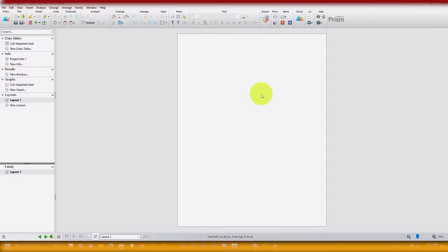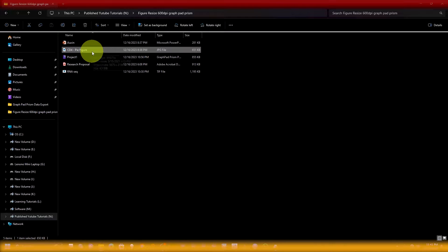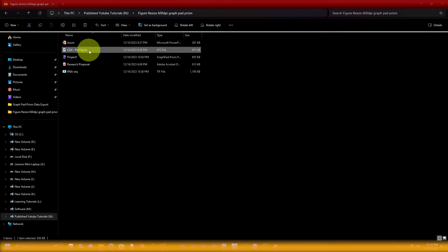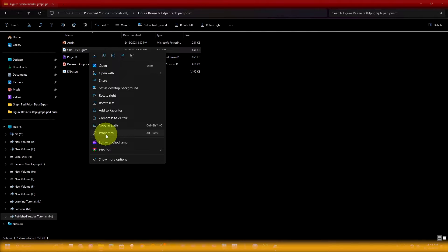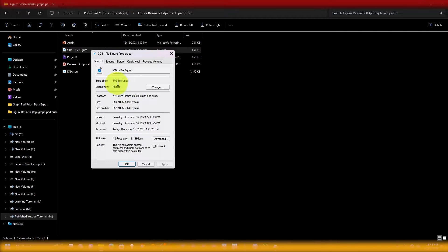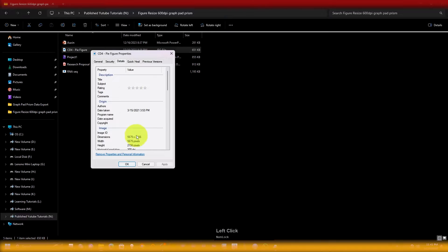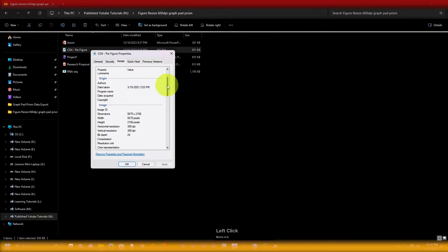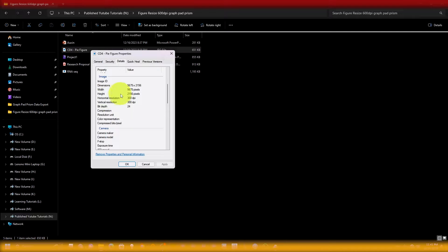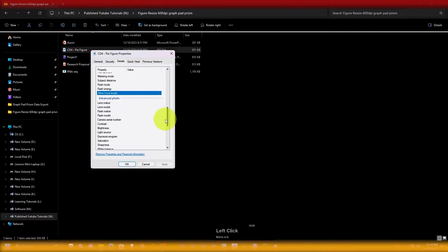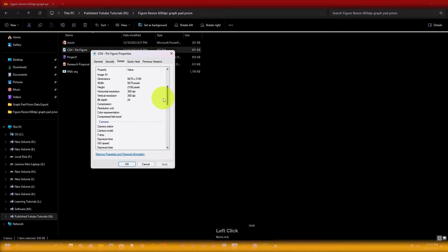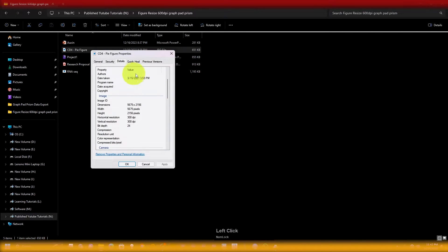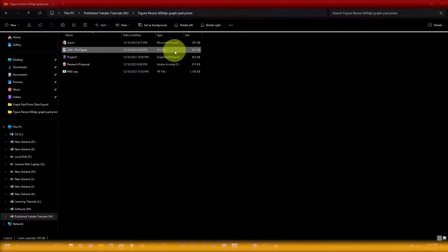Now you can see the layout is created. Here I am going to show you an example figure. You can see the format is .jpg, and if you right-click and go to properties, you can see the format is .jpg. In the details tab, if you scroll down, you can see the width and height in pixels and the resolution in dpi — it's 300 dpi. But if you need 600 dpi for this image, let me show you how to do this in GraphPad.